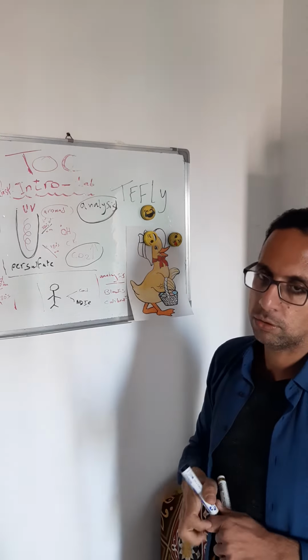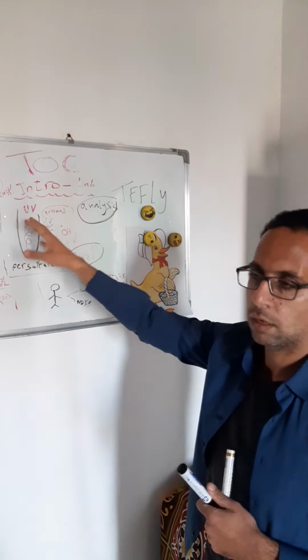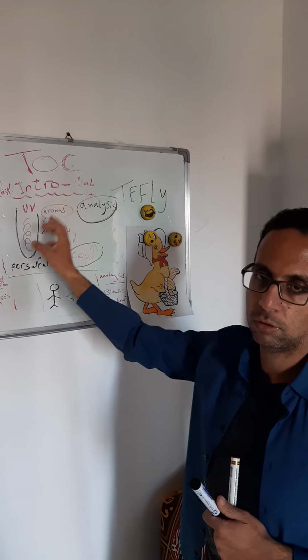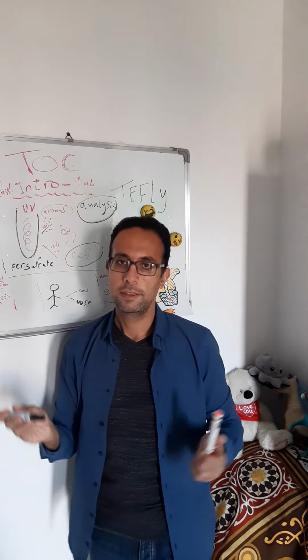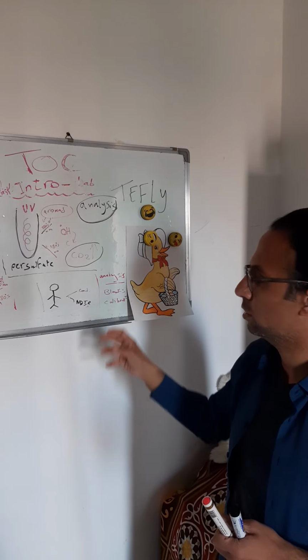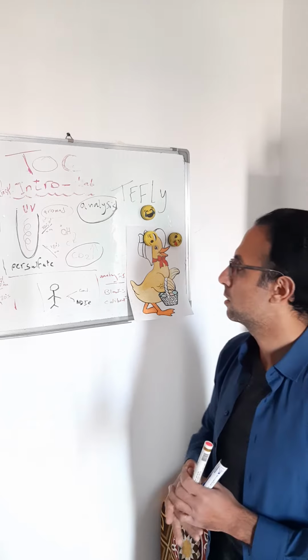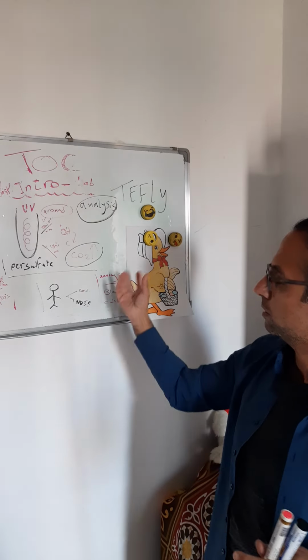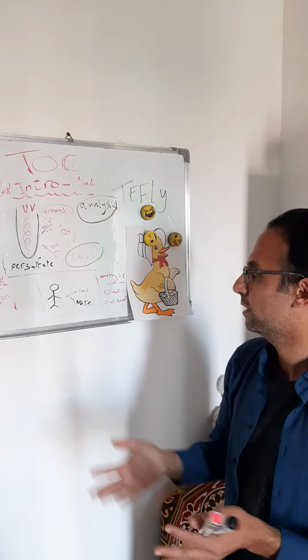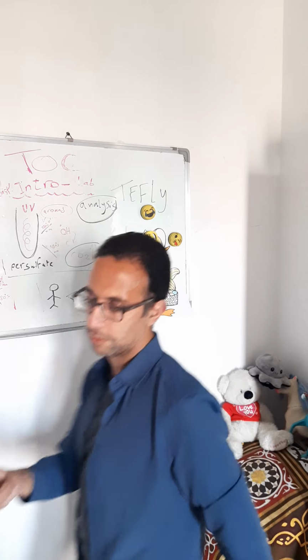We will talk now about the detection stage. For analysis, we explained UV. Combustion is similar but depends on high temperature, with the same idea of getting OH radical. Okay, we'll get now into detection. Sorry if I'm scanning, as I said, so maybe it's a lot of information, but I'm trying to make it as simple as I can. Hopefully I can. So we'll transfer into the detection stage.